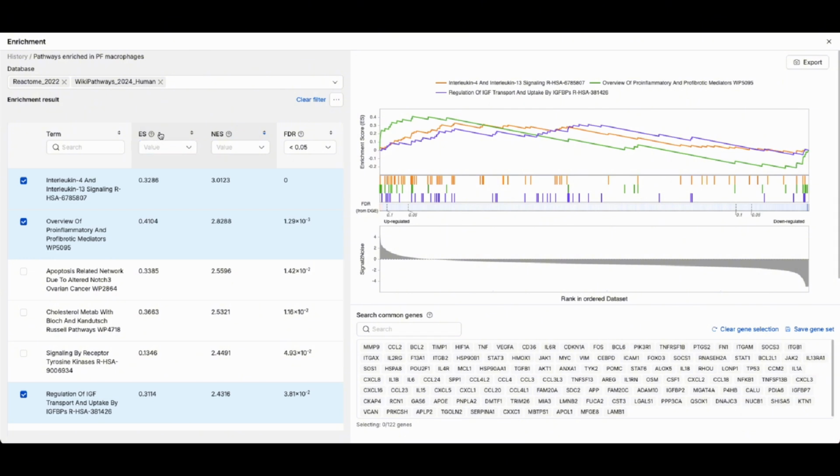Finally, pathway gene sets that are ordered near the top or near the bottom of the ranked list are likely to be enriched. Thus, this analysis helps to understand the broader biological context and cellular behaviors that are occurring. BBrowserX Pro uses GSEA to perform the enrichment analysis.